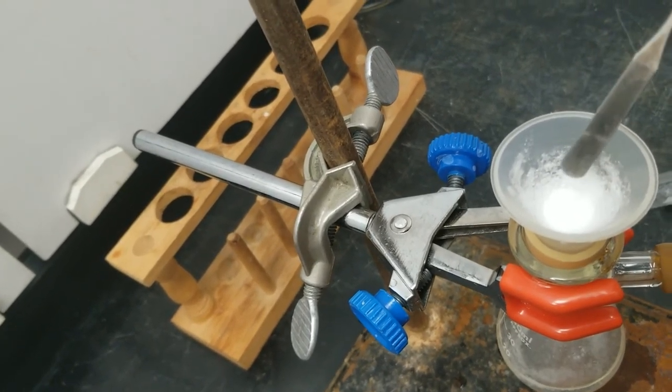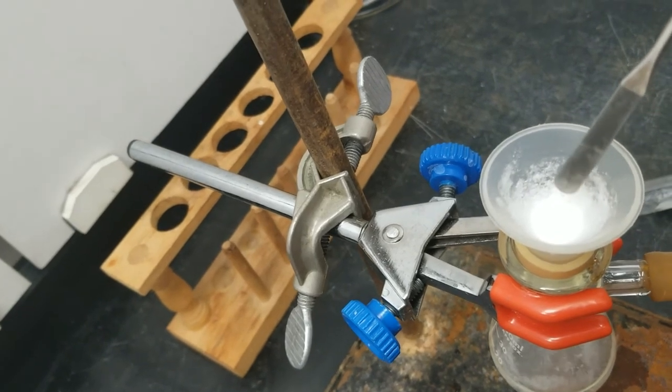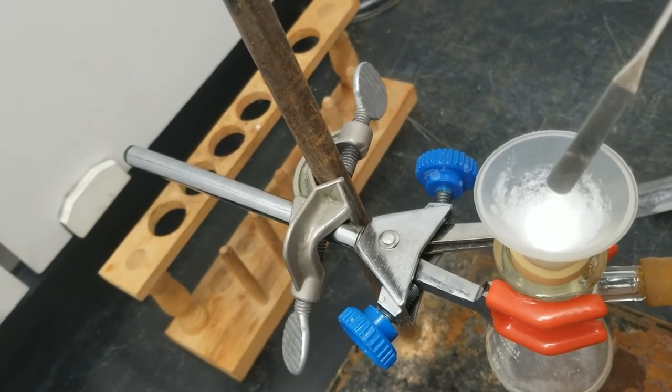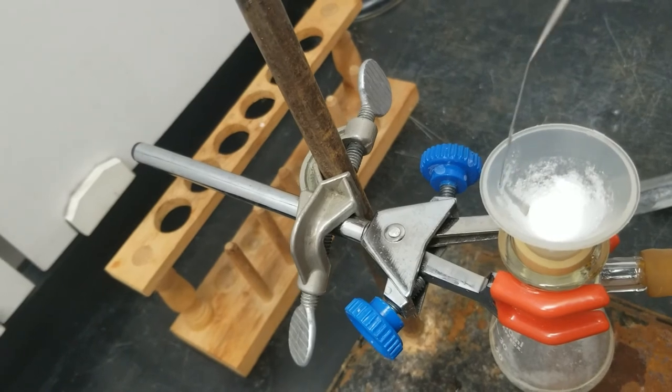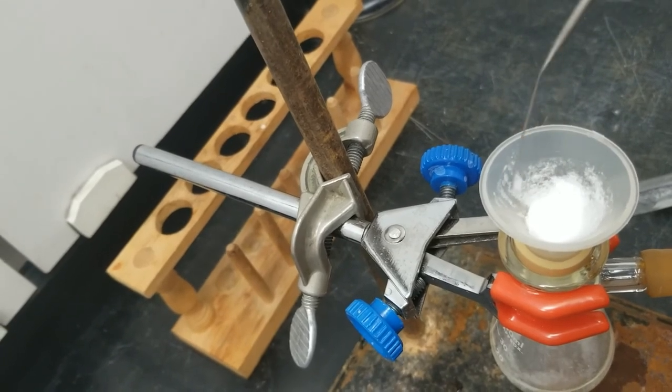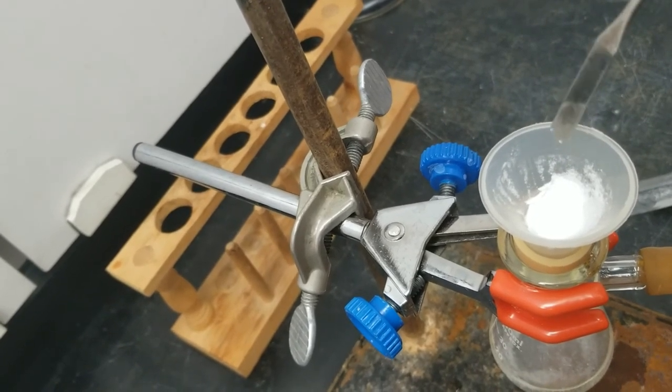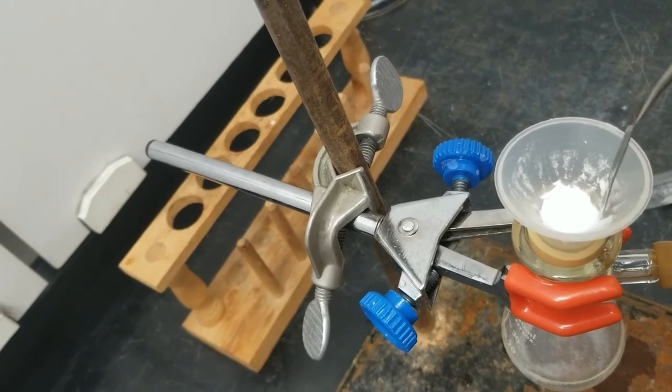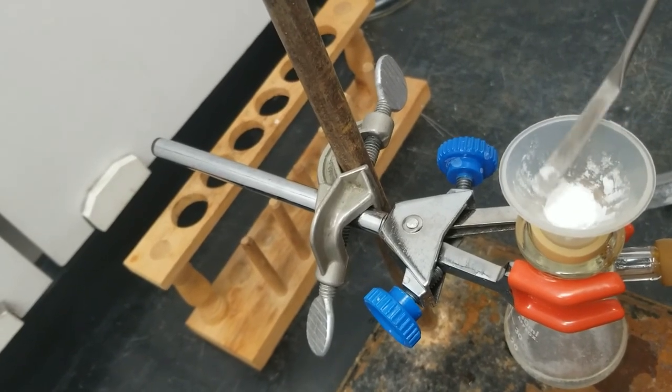So the air is being sucked through the filter paper, which is down here at the bottom of this cone in the Hirsch funnel. So I want the air to be passing over the product in order to dry it. So I'm going to get it down off the sides and get it down against that filter paper.